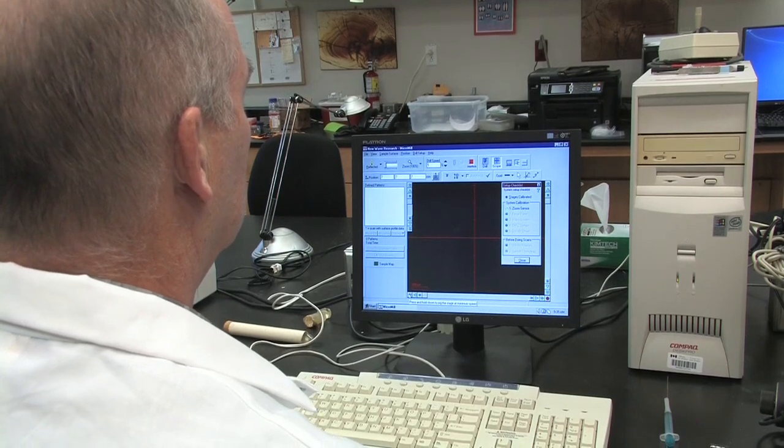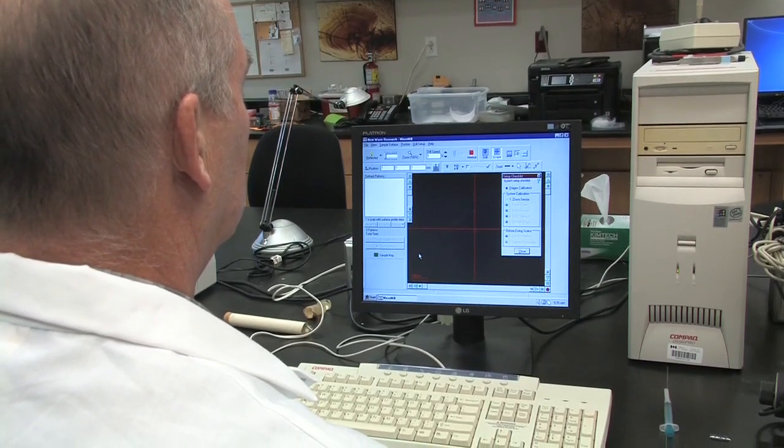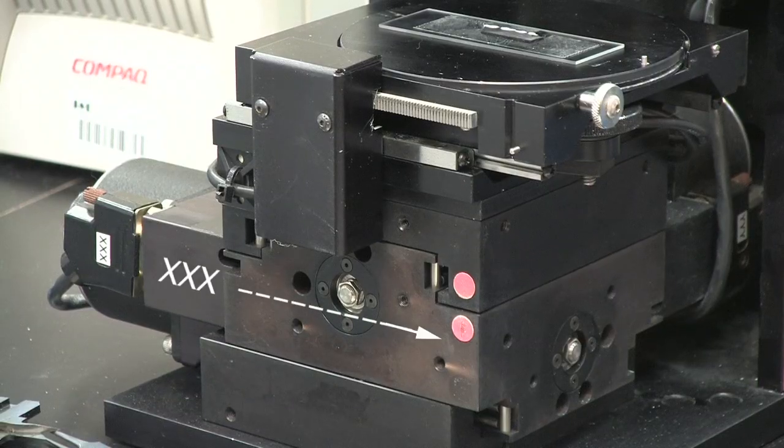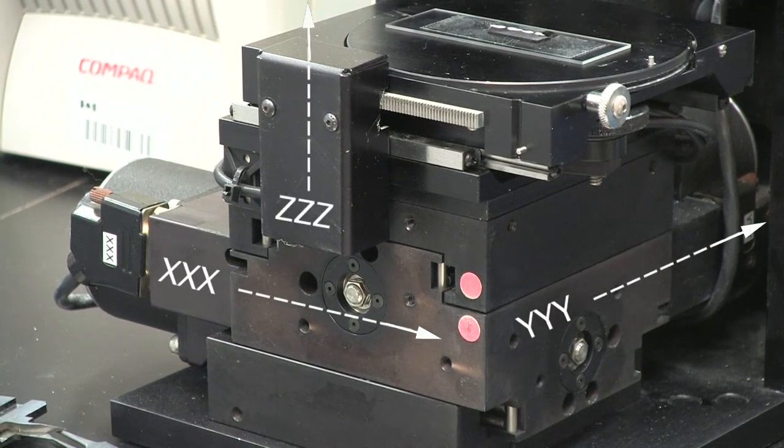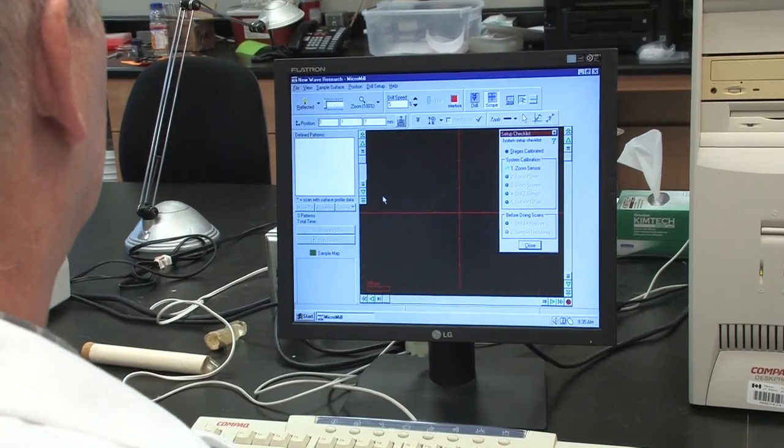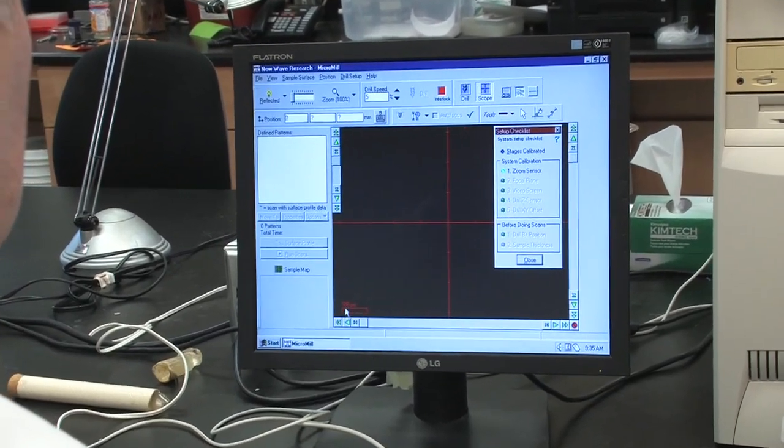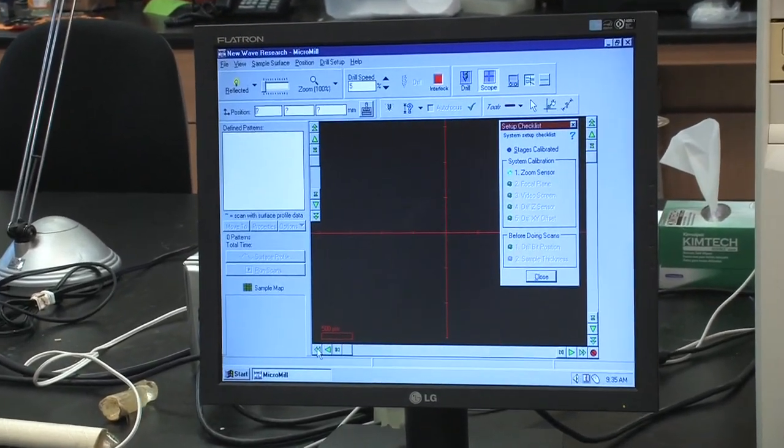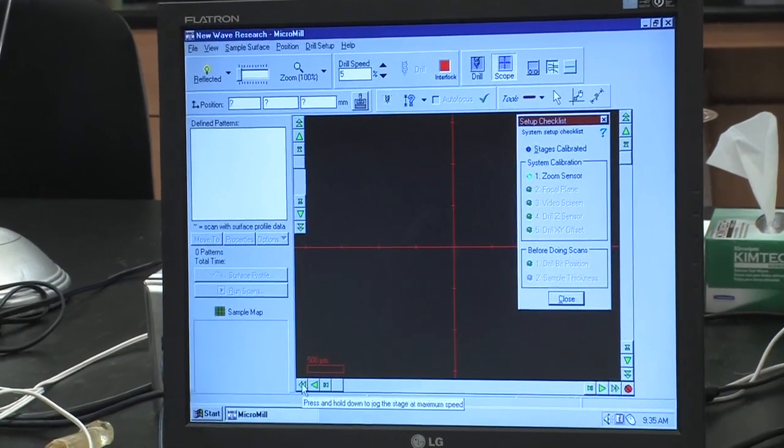On the screen, there will be three slider bars which control movement of the X, Y, and Z axes. By right clicking on the scroll bars, you can adjust the speed of them to one times, two times, five times, and ten times.